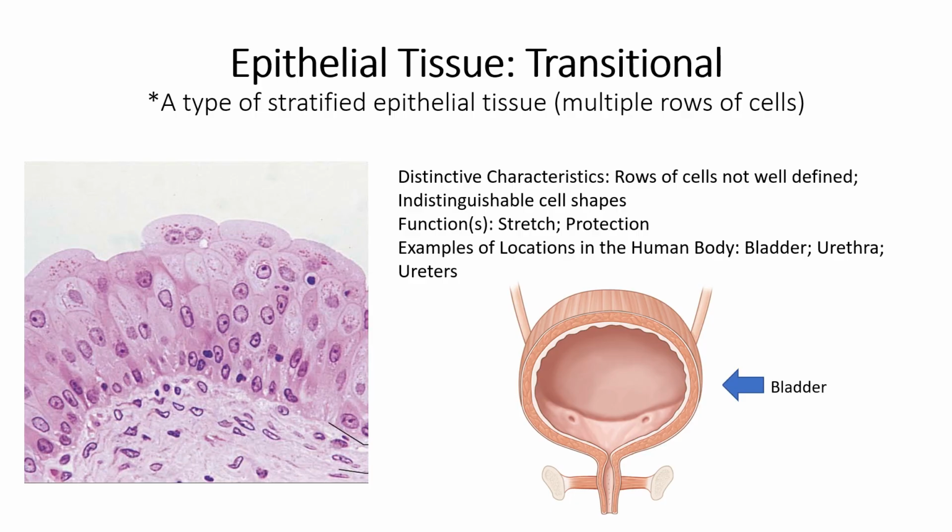With this, we have different shapes of cells in every row, all right? So kind of imagine an ancient stone wall where all of the stones are different shapes, but they all fit together tightly, right?